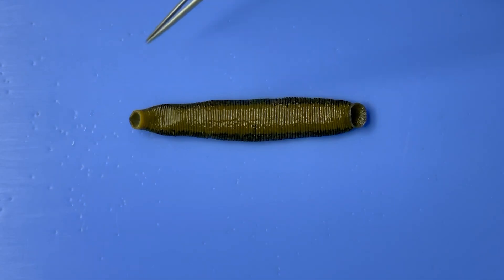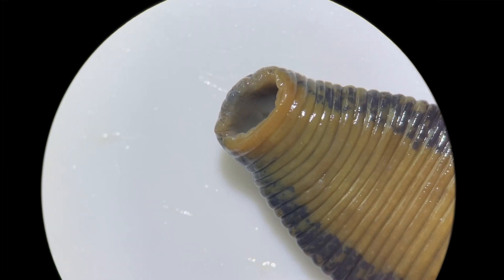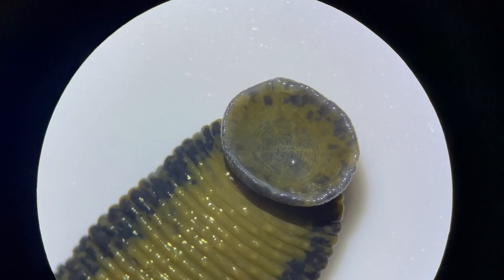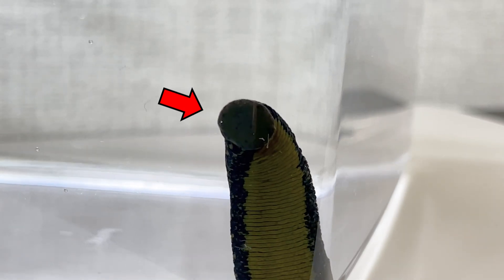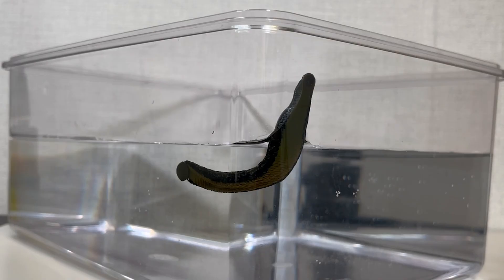When you flip the leech over, the thinner part is the head, while the broader part is the tail. Under the microscope, if you zoom in, this is the head part, and the tail end is the sucker. The leech attaches itself using the suckers on both sides.